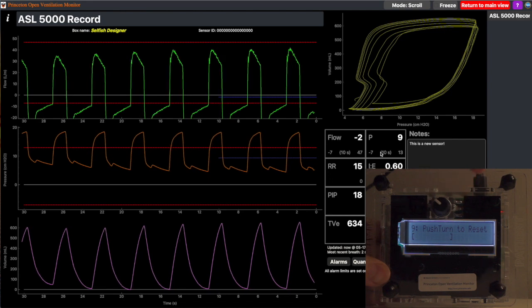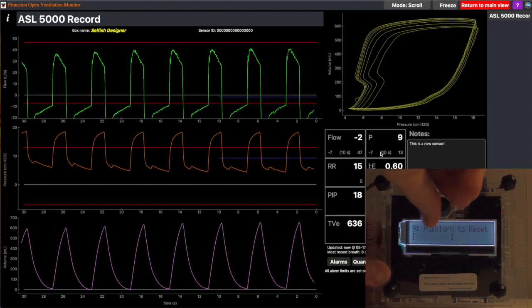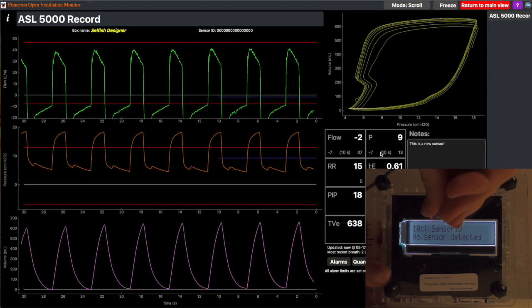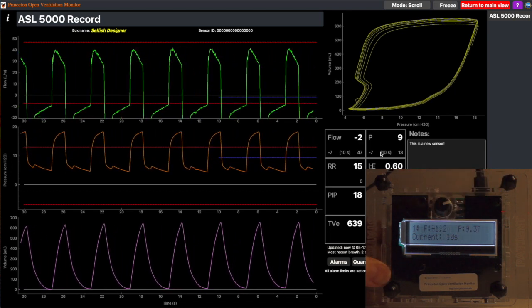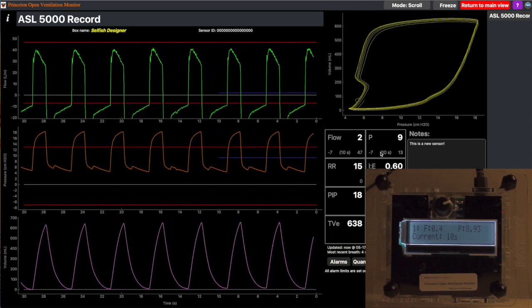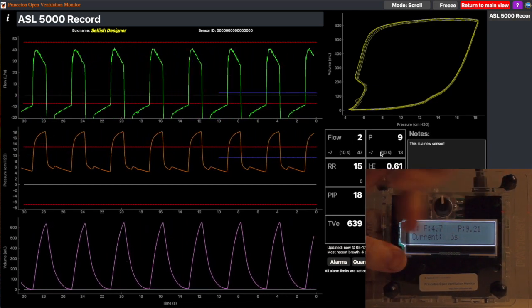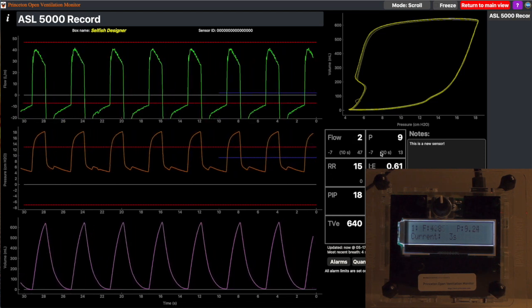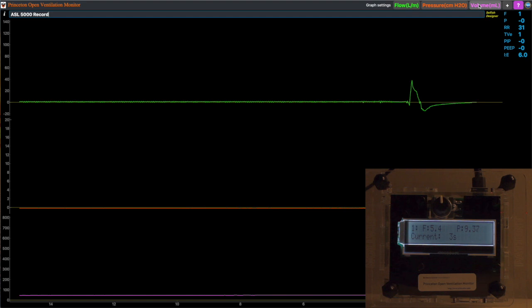There's a variety of other different options here that you can look at. There's this push turn to reset. You can just turn that all the way to reset everything on the box. There's also this hidden menu where you push turn to look through the different menu items, and these are the advanced items like the MAC address for the box. And you can also see that we can adjust this current setting, and that's just what it's averaging over to show you that display on the top here in this live screen.